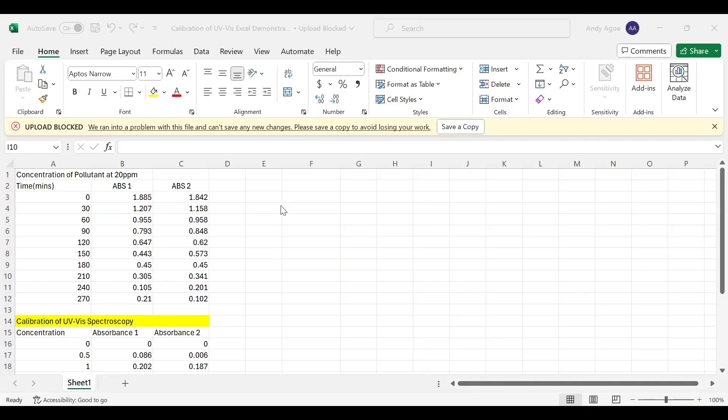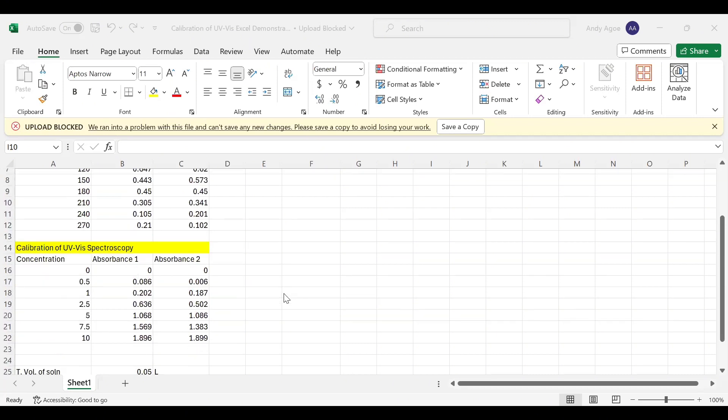Hello everyone, welcome to Cambrian YouTube channel, your ultimate destination for learning chemistry. Today we'll be looking at how to use the spreadsheet to convert absorbance into concentration and also how to plot your calibration line or curve.